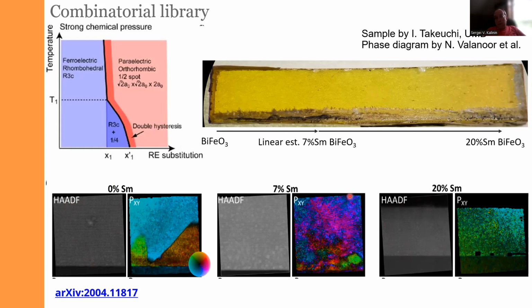And somewhere in the middle, we see these very interesting splotchy phases. So the question is, what can we learn from it? And more importantly, let's assume I have done 3 measurements. How do I choose locations for the 4th and 5th measurements? I need to be considerate about it because, again, each measurement is time on the FIB, time on the microscope, and time analyzing data.